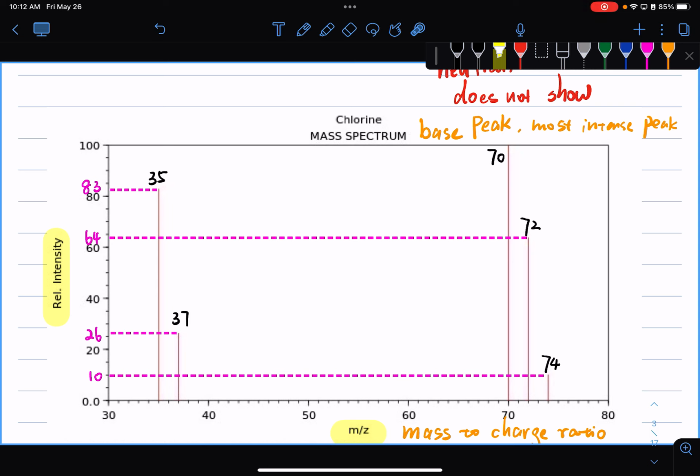Remember, we're talking about this molecule. Now you know it's chlorine, but without knowing it being chlorine, if I tell you this is a diatomic molecule, only 2 atoms, then you can look at the atomic mass and derive information. All right, so atomic mass here is 35 or 37. It has 2 different isotopes, so likely to be chlorine. So 2 different ways to analyze the problem.